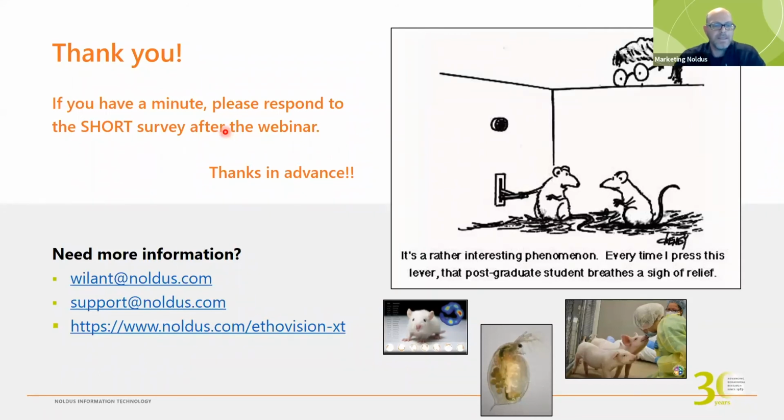Okay, another question for you, Wieland. When EthoVision provides values for missed and interpolated samples, is there a way to further sort by zones created in an arena to determine the amount or percent of missed interpolated samples per zone? Yeah, you can divide it up, select zones in your data profile, and then you get the number of missed samples for each zone. As far as I know, you can get all of that per zone.